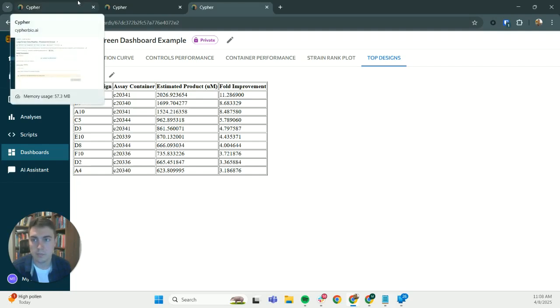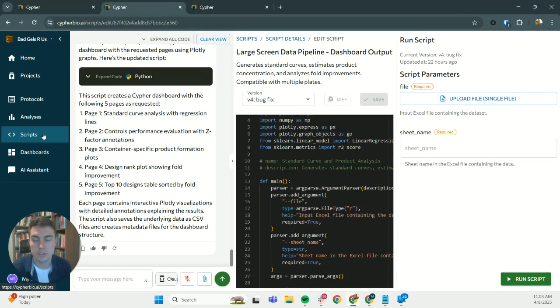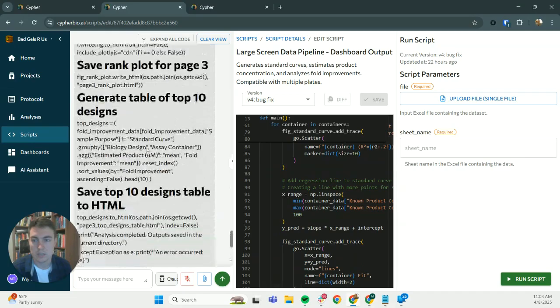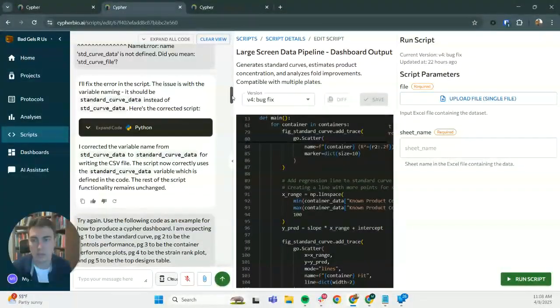So how did we make this? We made this using our large screen script that was generated using the scripts feature within Cypher Bio. You can see here's the code itself, as well as some of the conversations that I've been having with the chat.